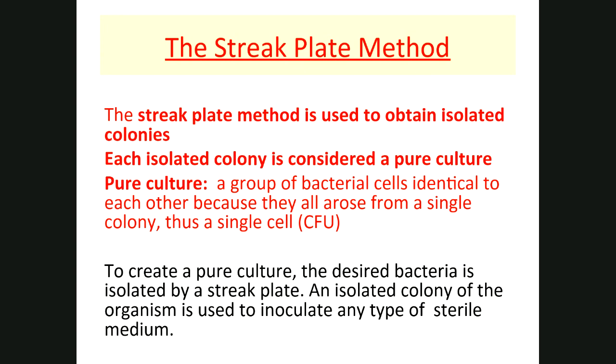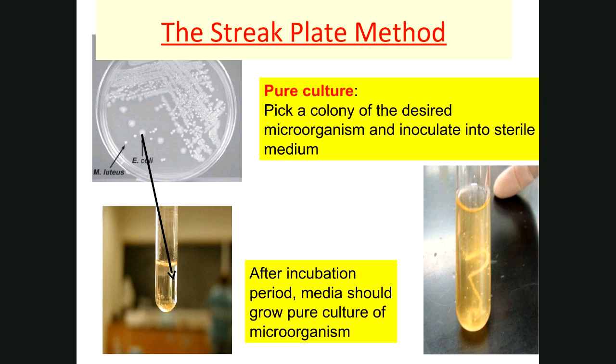If you obtain colonies, you'll be able to discern whether you have a pure culture. If you don't have a pure culture, you could make one. So in this example, notice that this is not a pure culture. You have this big white colony here, and then a little bitty colony, which is also white, but even the consistency looks different. It looks creamy.